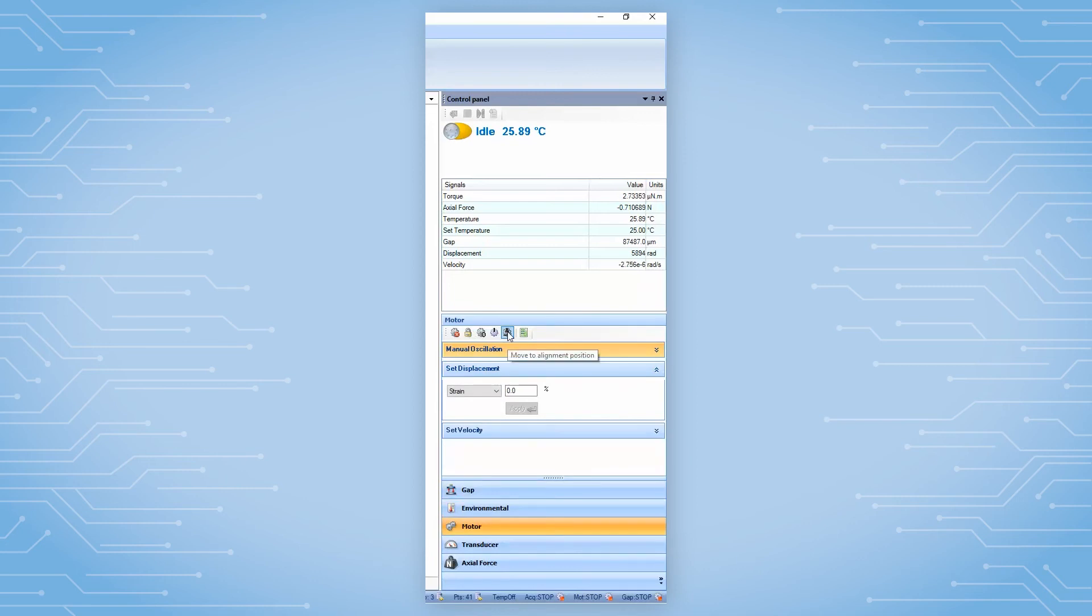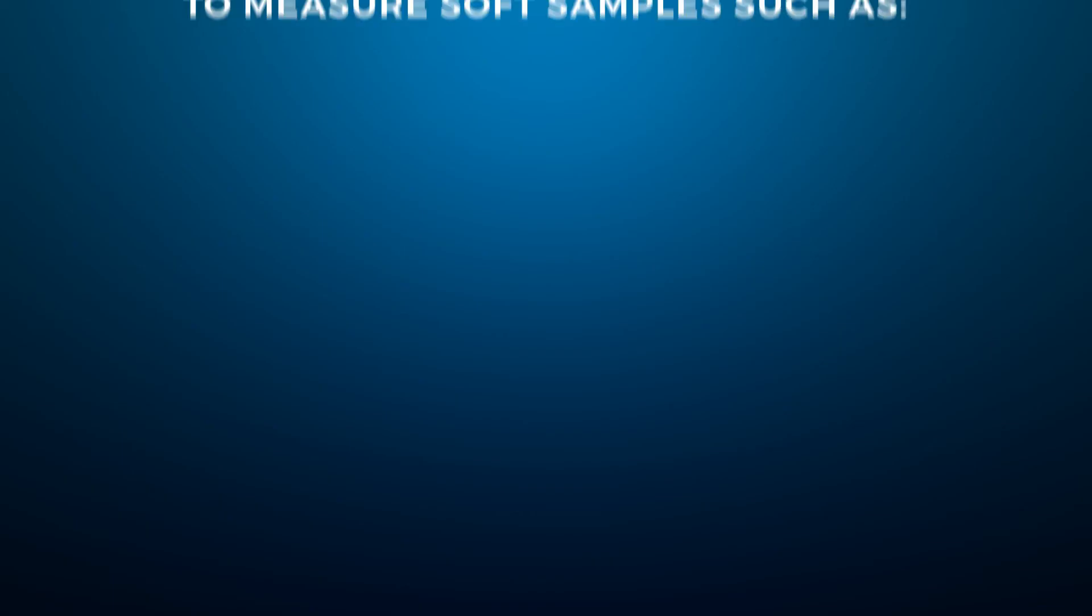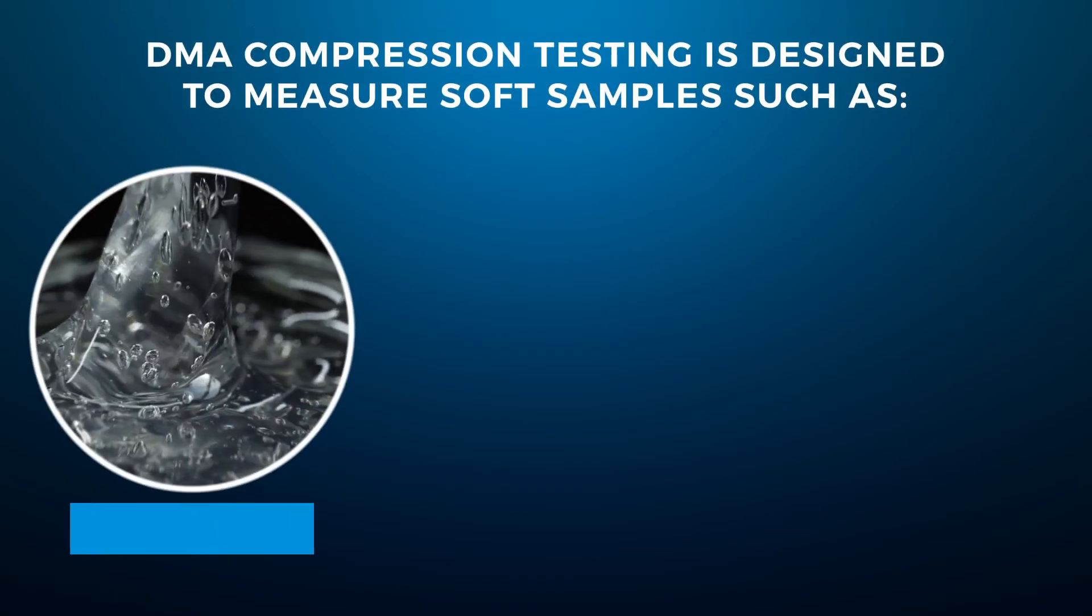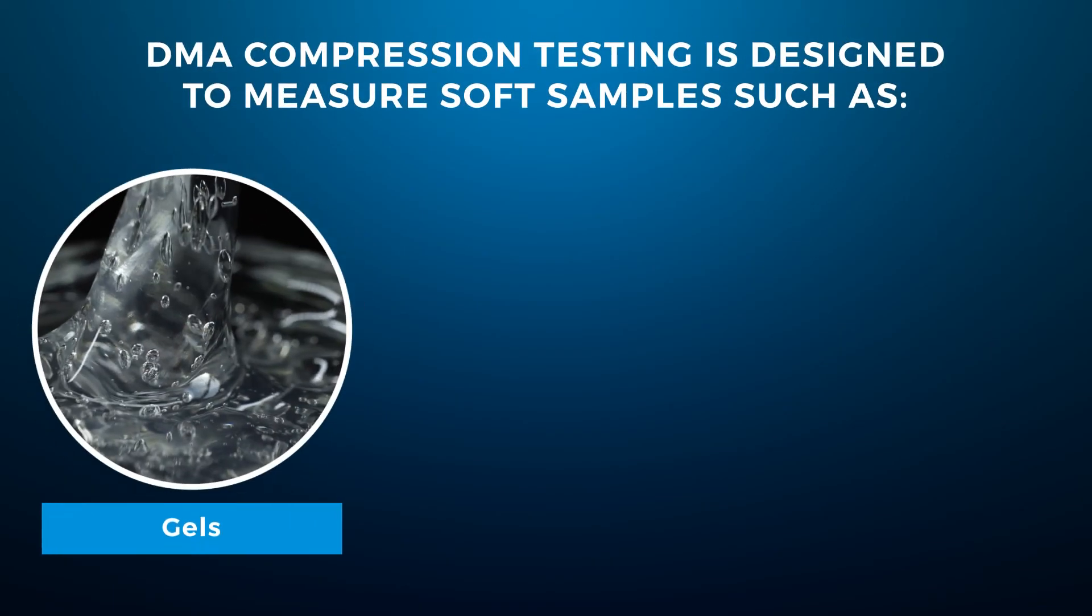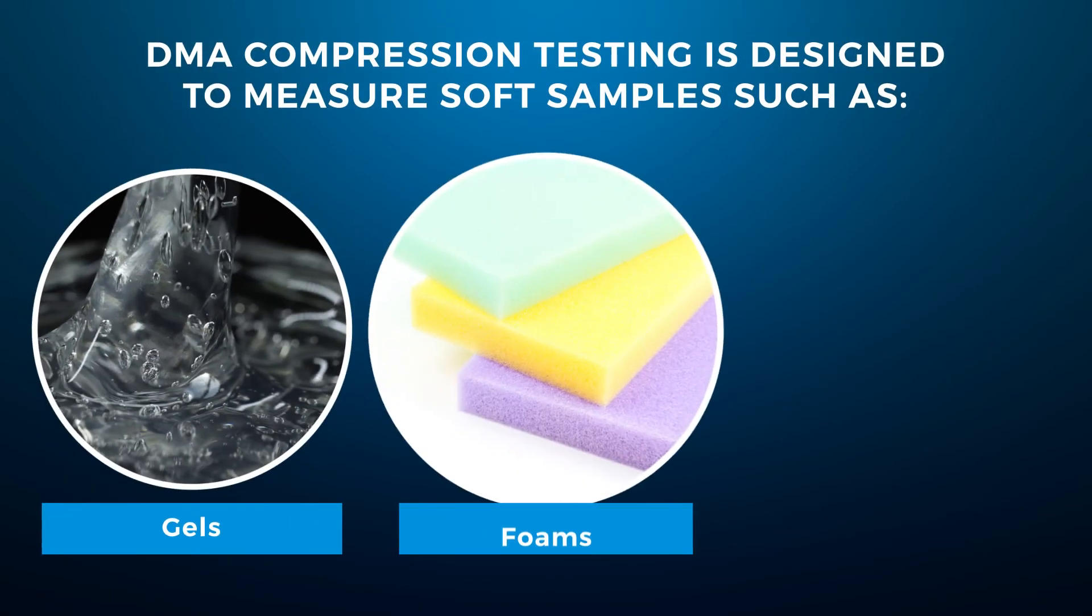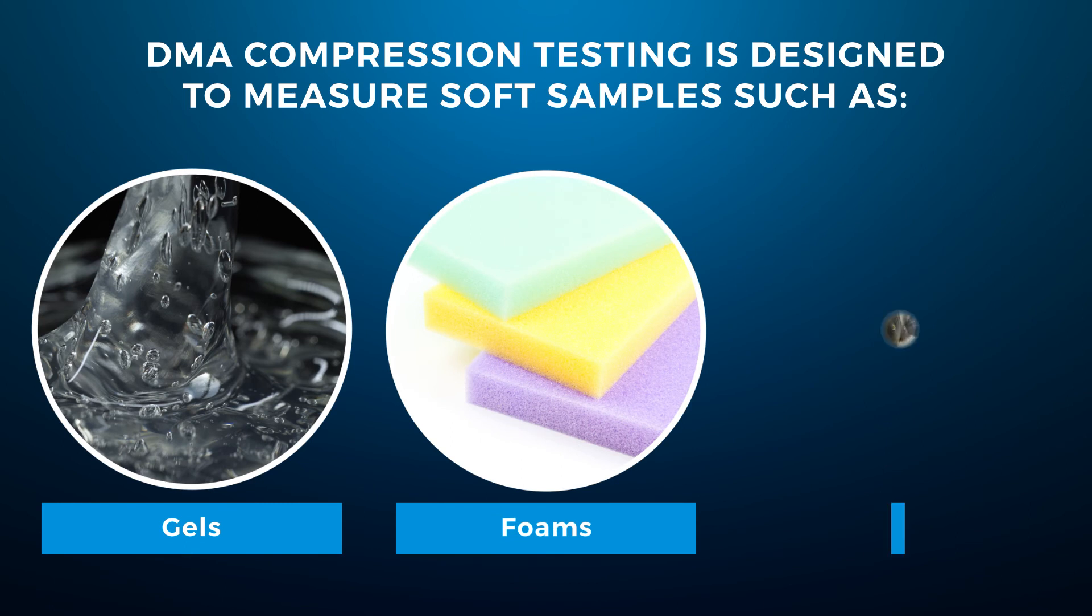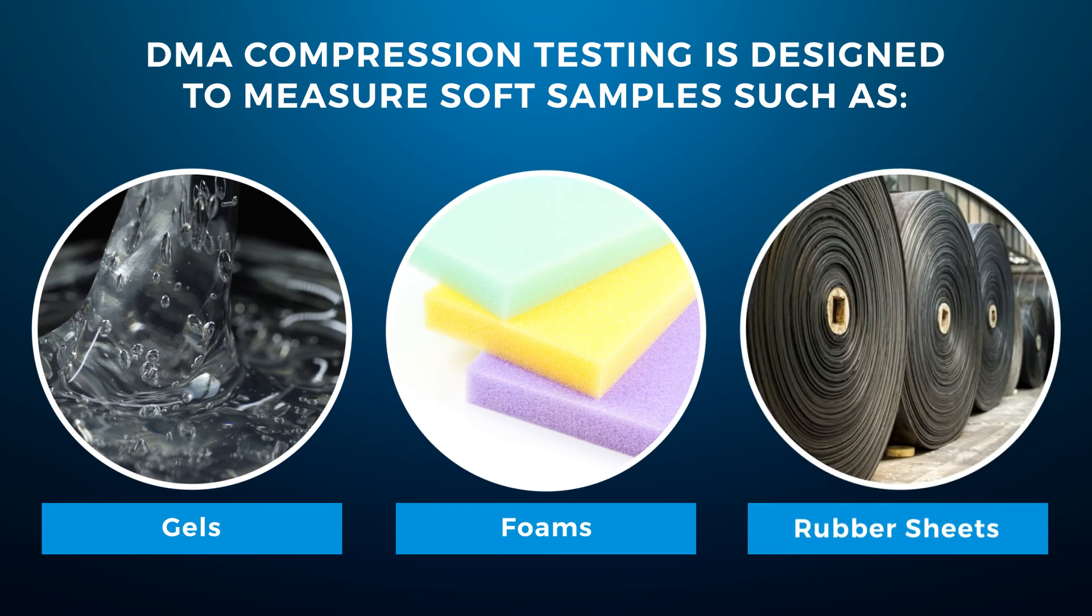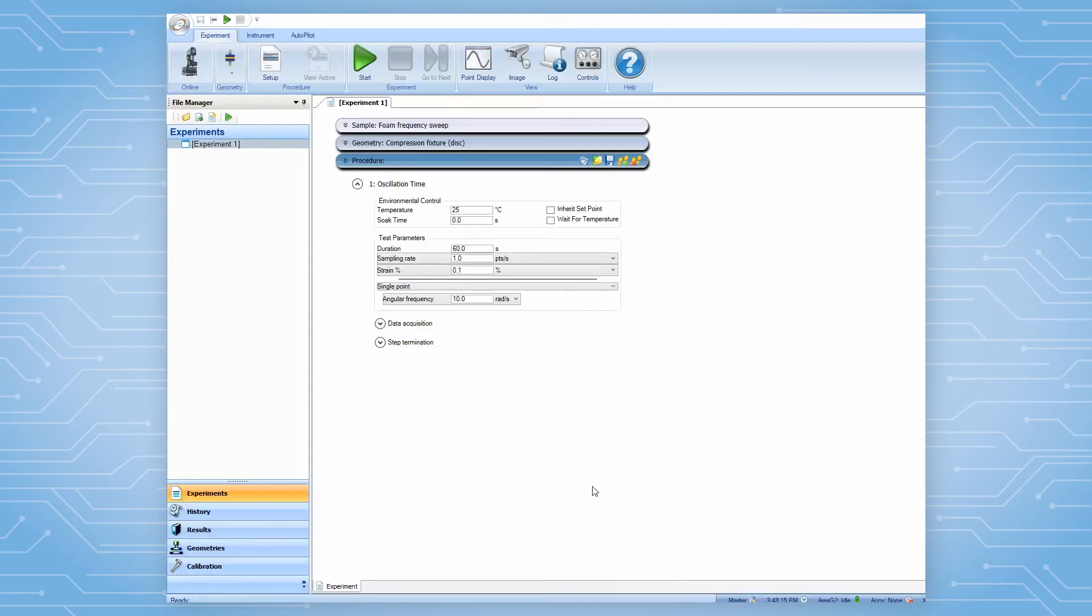We are now ready to use this plate to perform compression testing. Please note that DMA compression testing is designed to measure soft materials such as gels, foams, or rubber sheets above their glass transition temperature.